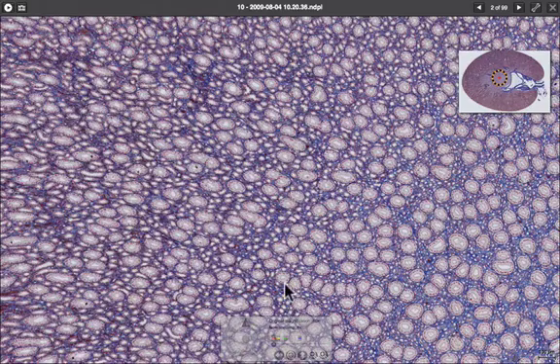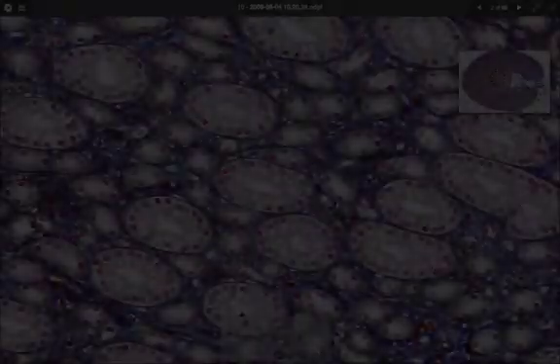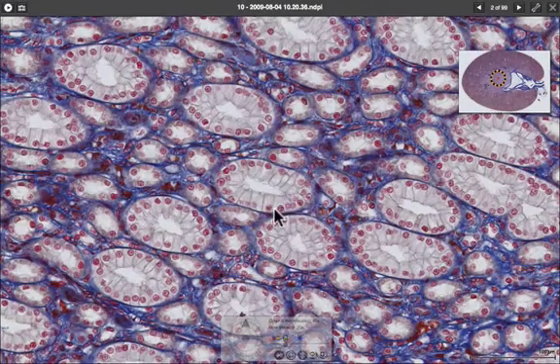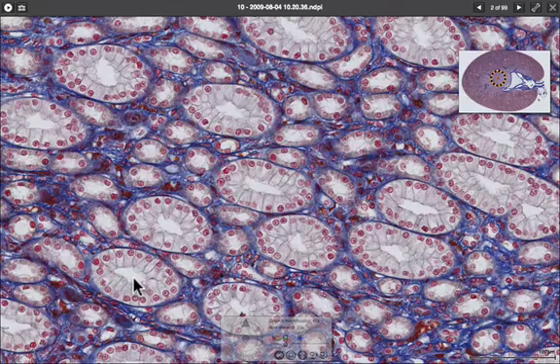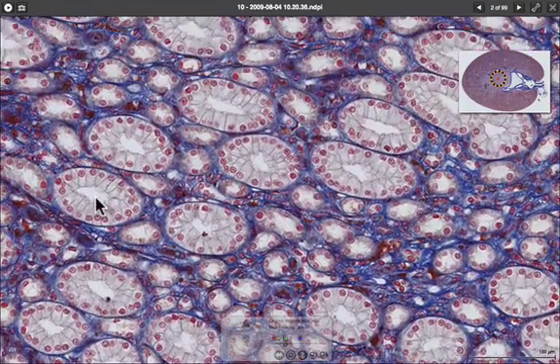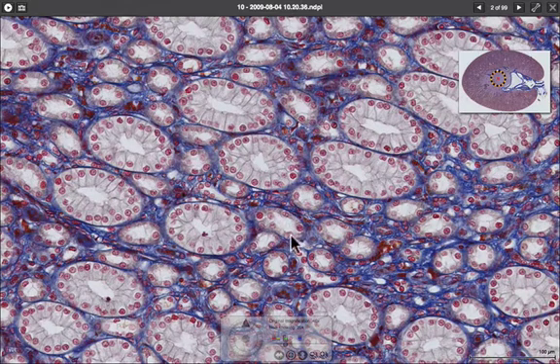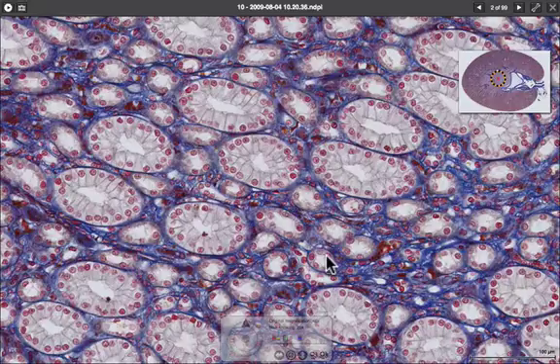In the medulla we can see lots of tubes in cross-section. These cells are columnar epithelial cells and these are the collecting ducts. In between the collecting ducts there are cells with cuboidal epithelium — these are parts of the loop of Henle, some ascending and some descending, with thicker and thinner parts.